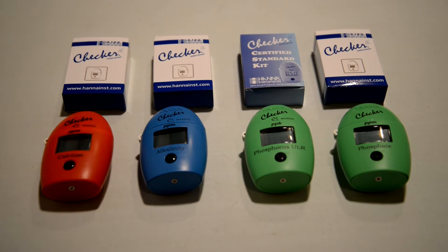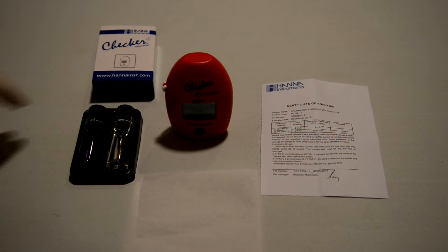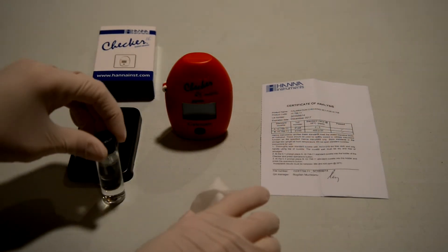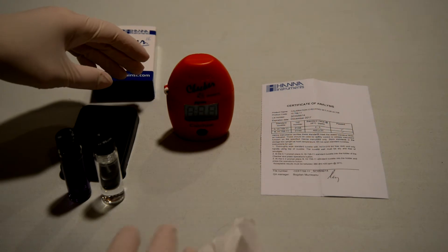There's good and bad to these checker tests — these calibrators. As you can see, we have them for calcium, alkalinity, phosphorus, and phosphate. You need some chem wipes to run them. This particular one we're going to start with is the calcium one. It comes with two tubes and a guaranteed analysis of what's in those tubes, and the range that the checker should fall within.